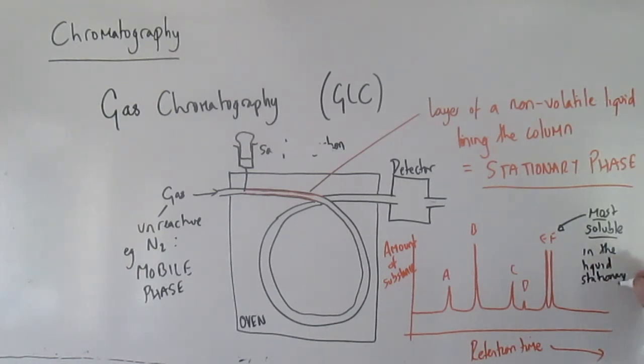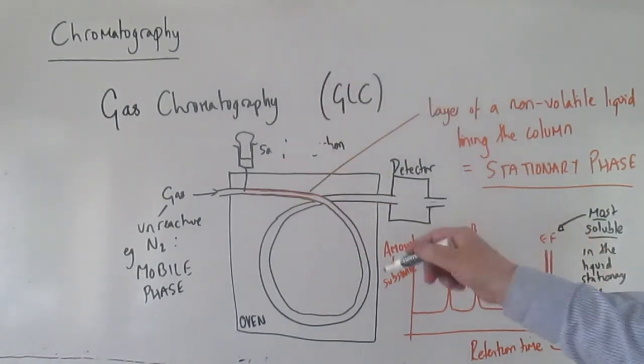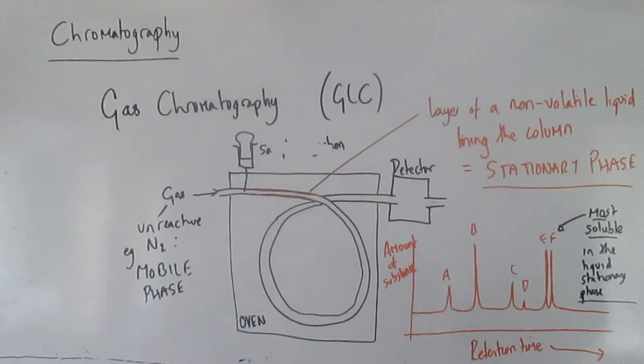Okay, so you've got to make sure that you can see that that makes sense, and remember to explain things in those terms. The more soluble it is, the more easily it falls out of the moving gas phase into the not moving liquid phase, and therefore the longer it takes to finally arrive at the detector at the other end. So those are the basic principles of the method. When you talk about it, therefore, you talk about solubility of the substance in the liquid stationary phase. The more soluble it is, the harder it finds it to make its way through the column, so the longer the retention time will be. So you don't talk about Rf, it's different from TLC. Retention time is the analogous factor.